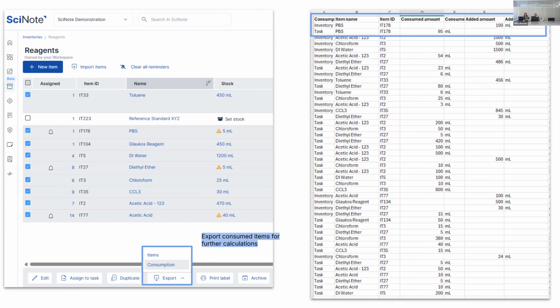I would emphasize that especially during the implementation of a new system, and it really doesn't matter what kind of system, it's important that you get the whole team involved and ensure that everyone understands the importance of regular updates and that they update them as they go. So not, I'll do it at the end of the week, but they do it at the very time.